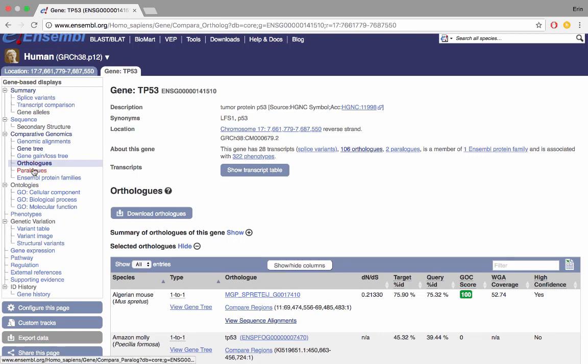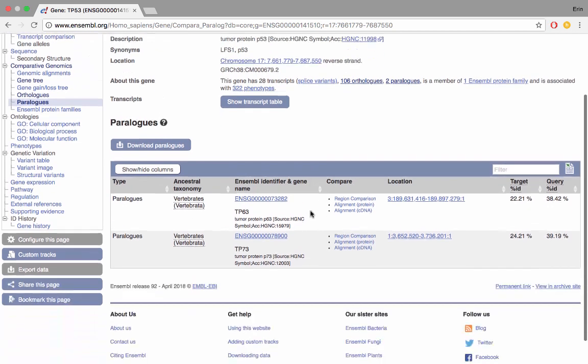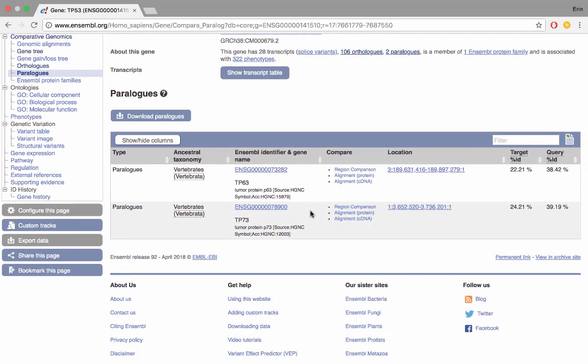We've had a look at orthologs now let's move on to paralogs. What we have here is a list of genes that have evolved from duplication at some point in the past alongside TP53. These are called TP63 and TP73 and we have options to view region comparisons, protein and cDNA alignments as well as to view these genes directly in Ensembl. Similar to the ortholog table we also have target ID and query ID.